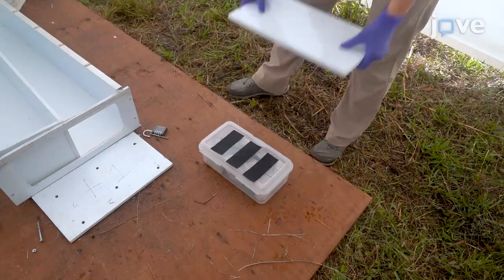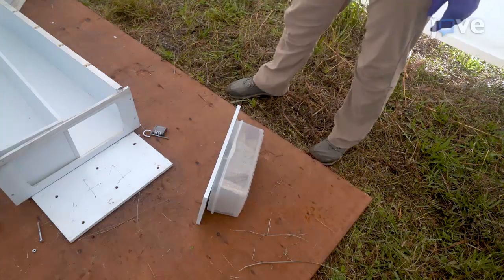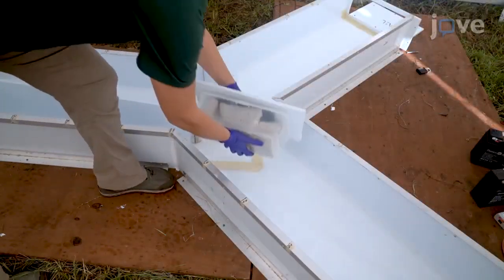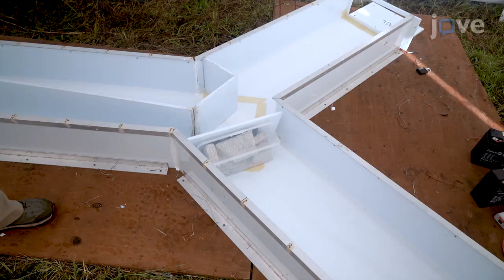For large scenting animals, affix a heavy object that can be easily removed and cleaned behind the barrier as a brace to prevent barrier failure. Then, install the barrier at the entrance to the opposite arm. When installing the barriers, do not rip the scenting paper.